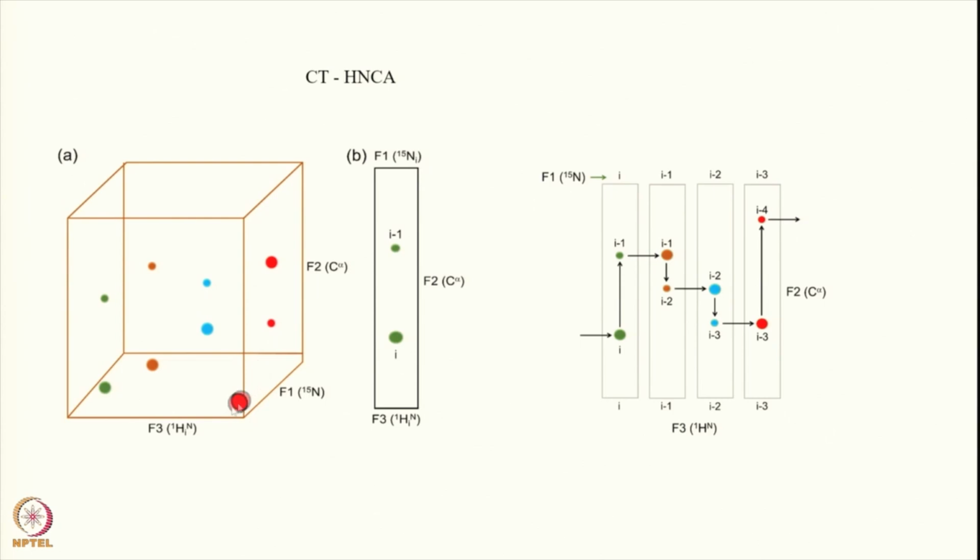Okay, when you move through the N15 plane at this particular C alpha, this peak will become the self peak, because it has to have a particular self peak also. So you search through the N15 plane here, and at the particular chemical shift of the N15, you find exactly at the same C alpha chemical shift a strong peak. This strong peak is therefore the self peak of residue I minus 1, and correspondingly you have another peak which is the weaker peak, of I minus 2.